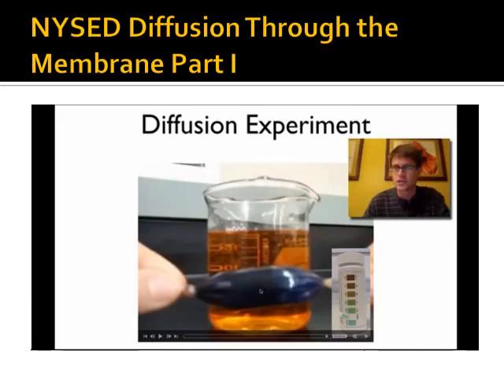It seems like the color has changed a little bit. If we were to now test it for glucose, what we would find is that there is still going to be a positive for glucose inside. But now if we look out here, there's going to be a positive for glucose out there with a test strip. And so that's kind of all the diffusion demonstration is.